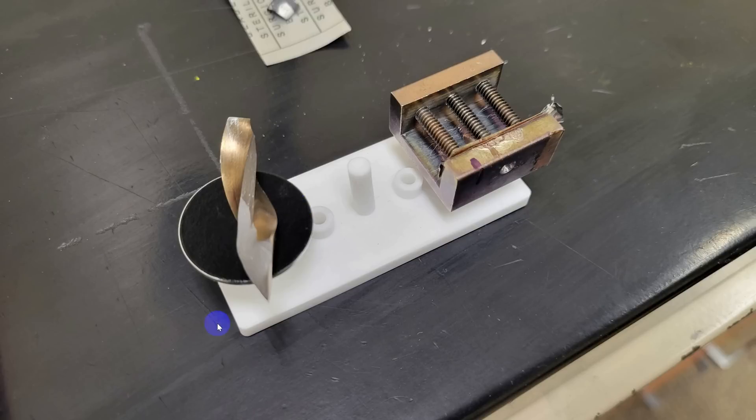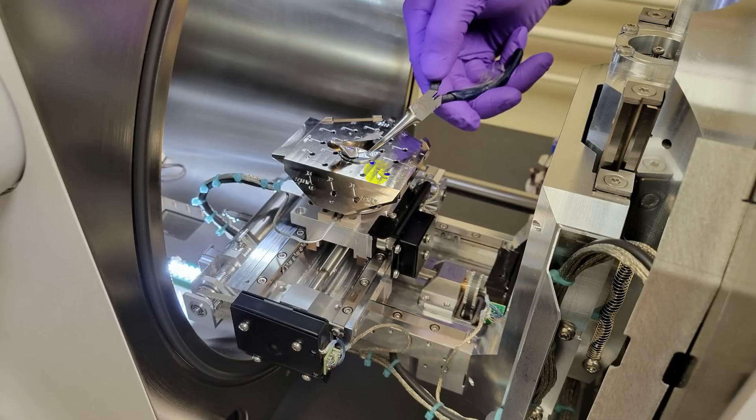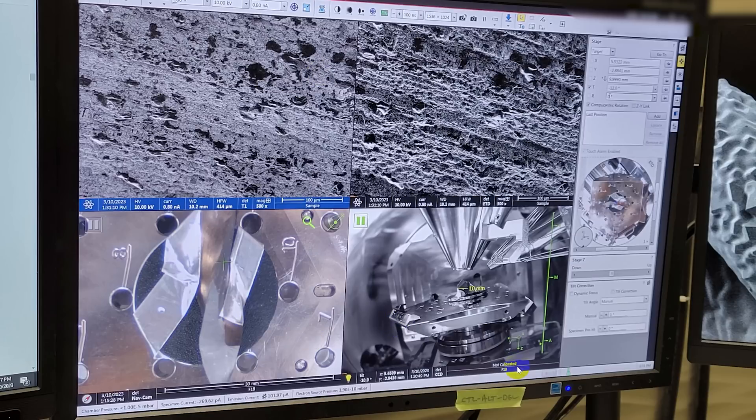The sample is loaded onto a little conductive platform that can then conduct the electrons away so that the sample doesn't charge up, and can also be used to measure the current that's flowing through the sample from the electrons absorbed by it. In this case we just took the broken piece of the drill bit, put it on the platform, and then taped it down with some conductive tape and then place that into the vacuum chamber of the electron microscope. And you can see the microscope has an XY stage here and it has the ability to tilt the sample back and forth, because the electron beam is always coming directly down from the top. So if you want to image different portions of the sample or if you want to image from different angles, you can move this around robotically inside the vacuum chamber.